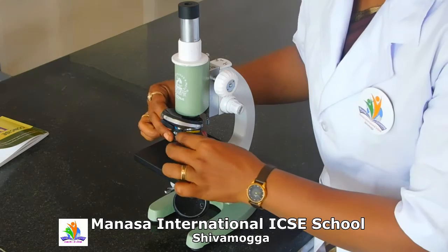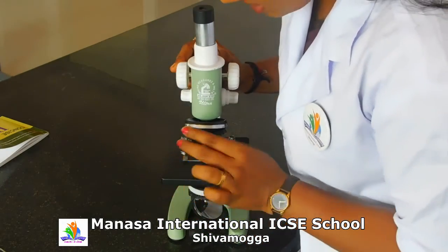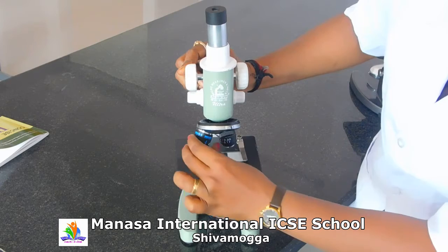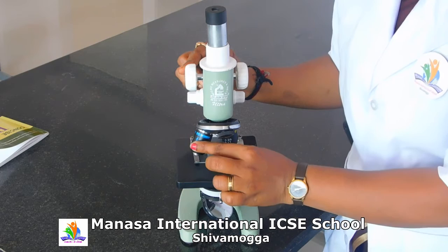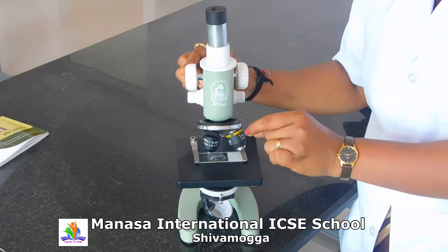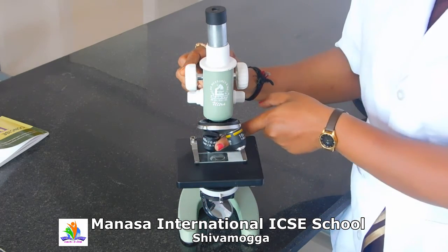Here we have two objective lenses, the high objective lens, okay, the bigger one, it is the higher objective lens, and the smaller one, it is the lower objective lens. In the higher we have 45 into 0.65, that is the higher objective lens, we can magnify it, and here the smaller one, the objective lens, where the material will be viewed in a smaller magnified way. Here in the larger one, you can see the internal structure also through this.